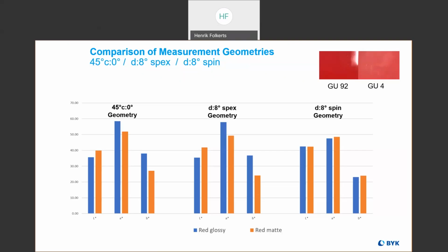Yeah, I mean, the size would certainly be the problem. So we have a small aperture model in our color guide instruments. That would probably be your best bet. It's a 4mm aperture, so you should be able to measure a tooth with that. I'd say any other instrument, the aperture would be too big for measurement.